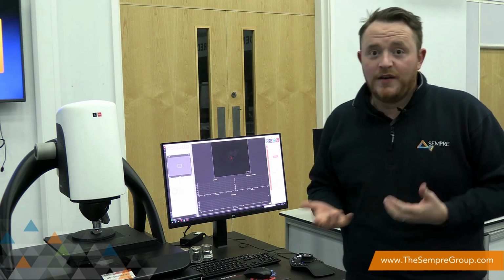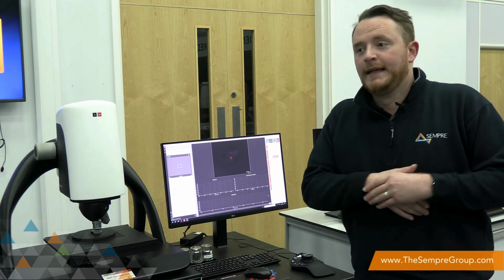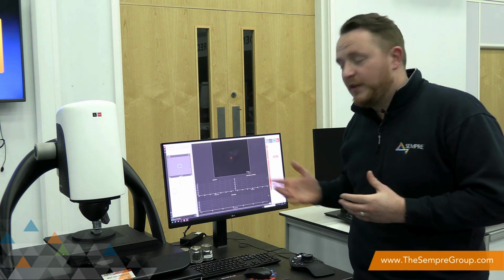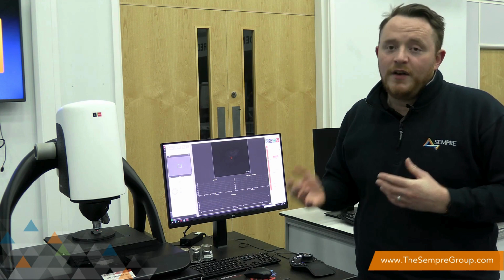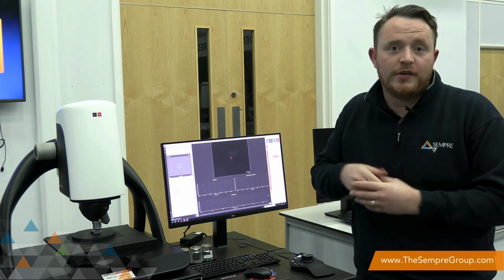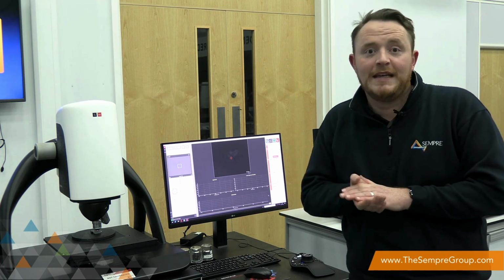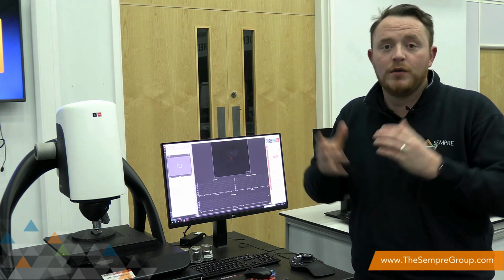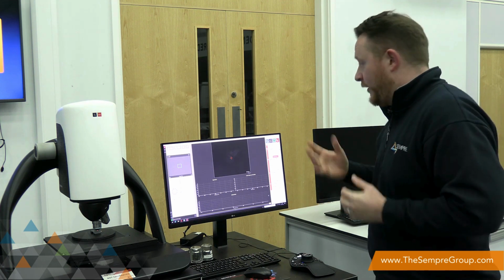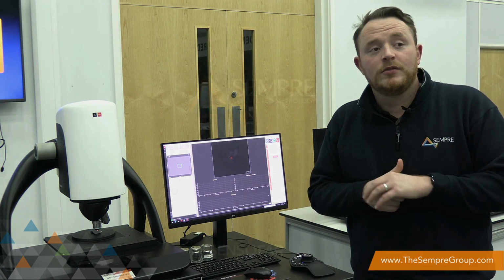If anyone's got any further questions on that, or has examples or applications specific to it, we'd be more than happy to run through the principle of that measurement. We tend to find that applications for us lead down the consumer electronics route, and also some automotive applications specifically relating to the EV world now. So it's a very quick overview, but if anyone needs any more information, then please don't hesitate to get in touch.